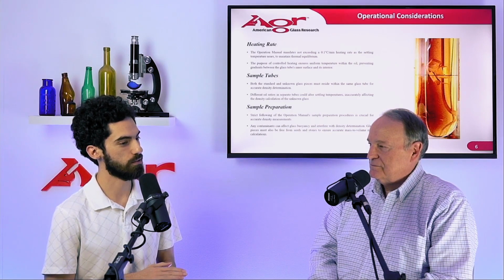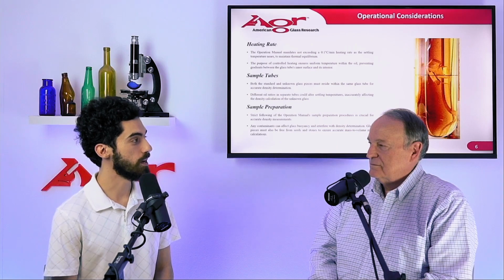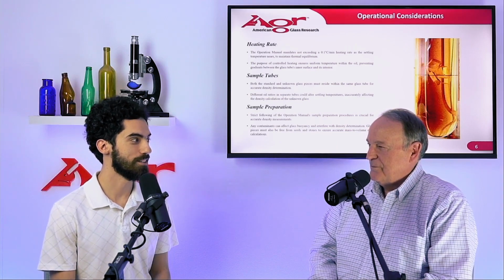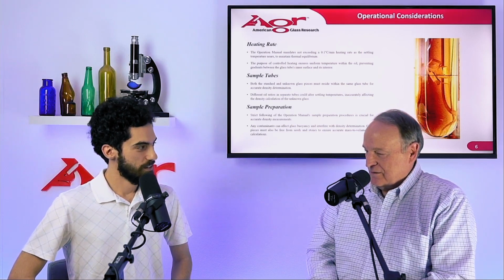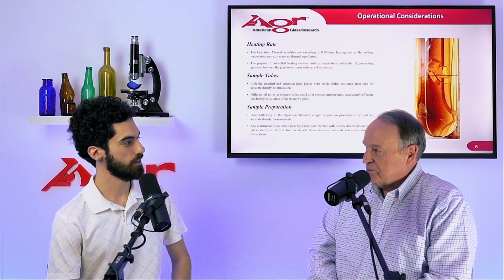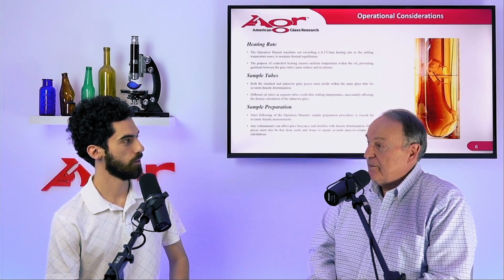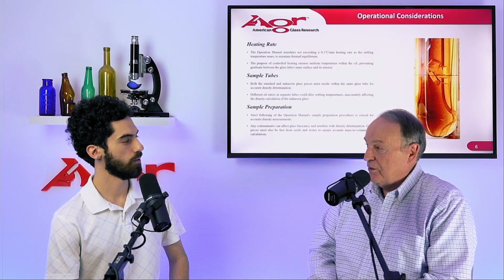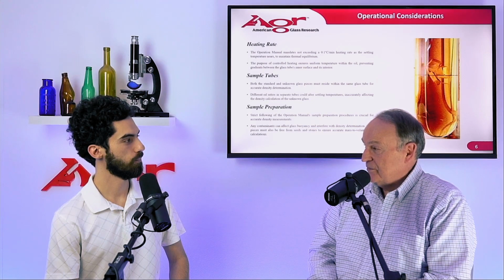If you were to heat this up at a centigrade a minute, is that too hot? Is that too cool? What's the deal here? According to the ASTM standard that covers this method, you are supposed to cool the temperature of the water bath and the oils to a value about 2 degrees centigrade below the temperature at which you expect the settling value to be.